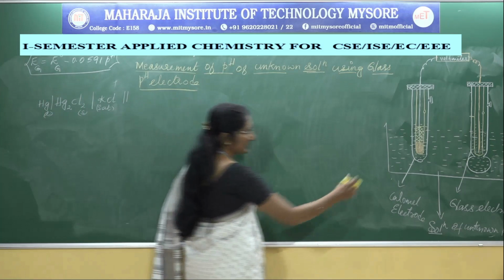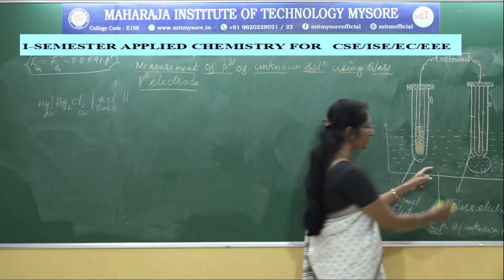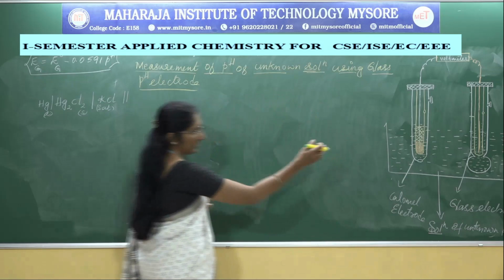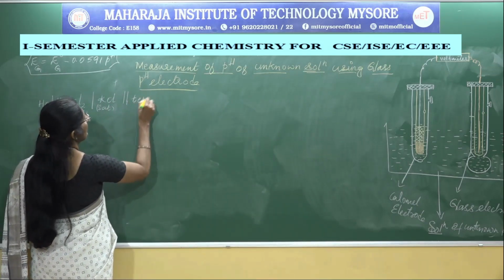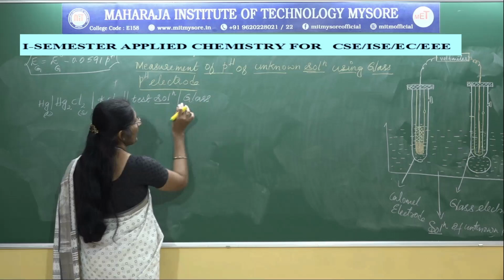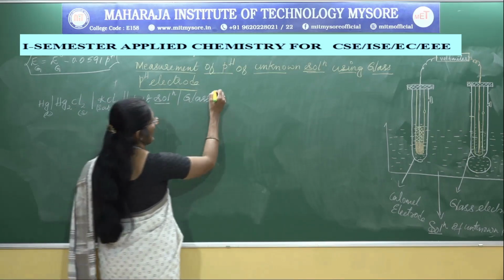Next, the representation of the glass electrode. Observe that the H plus ions are exchanged through this unknown solution. Therefore we have to mention it here as test solution. Through the glass membrane there will be an exchange of H plus ions between this test solution and the glass.